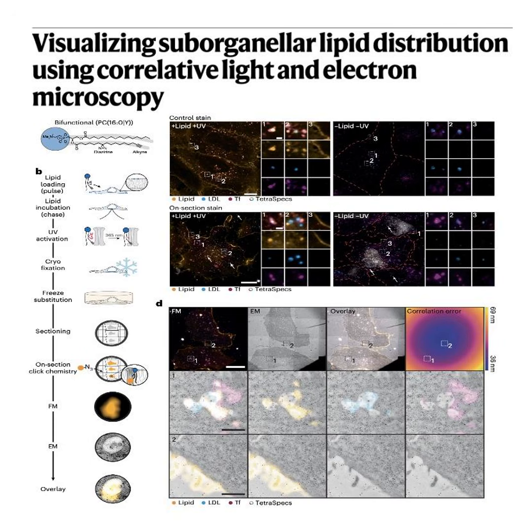And the report gives us this really fascinating tale of 2 very different resins. Let's start with HM20. Okay, HM20, this is an apolar resin, right? Yes, it is highly hydrophobic. Because of that chemical nature, the polar reagents needed for the click chemistry reaction just cannot penetrate the block. So the fluorescent signal is stuck on the surface. Strictly confined to the absolute edge of the section. We're talking about a signal penetration width of just 0.45 micrometers.